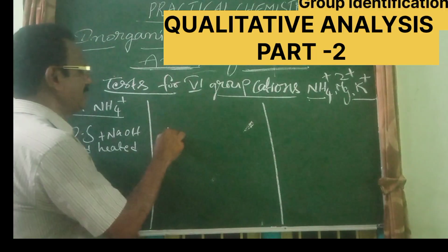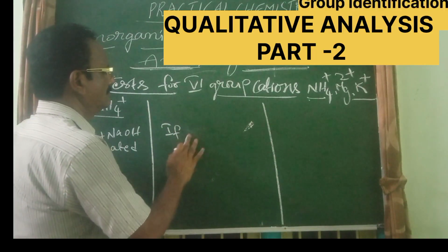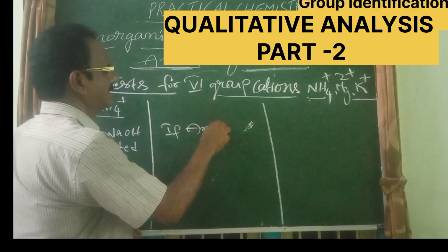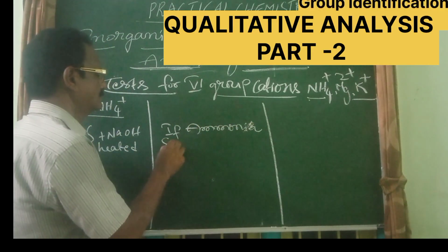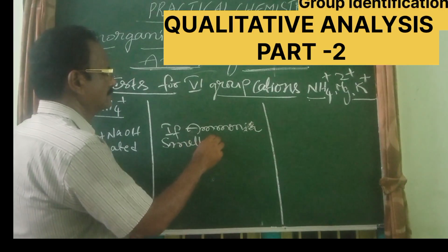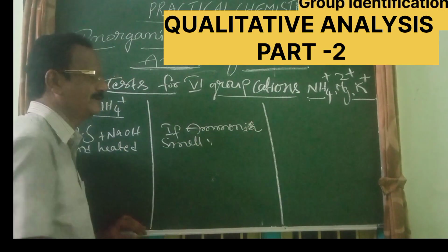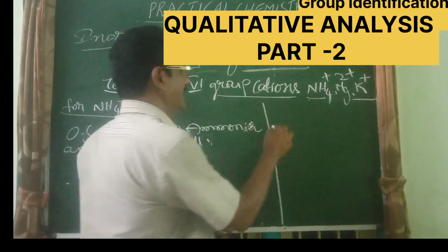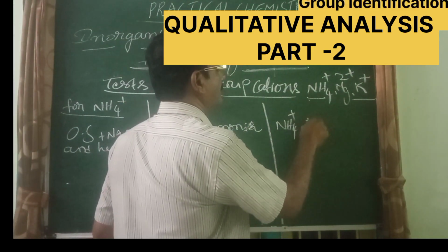If you get an ammonia smell, if an ammonia smell is there, then the presence of NH4+ is confirmed.